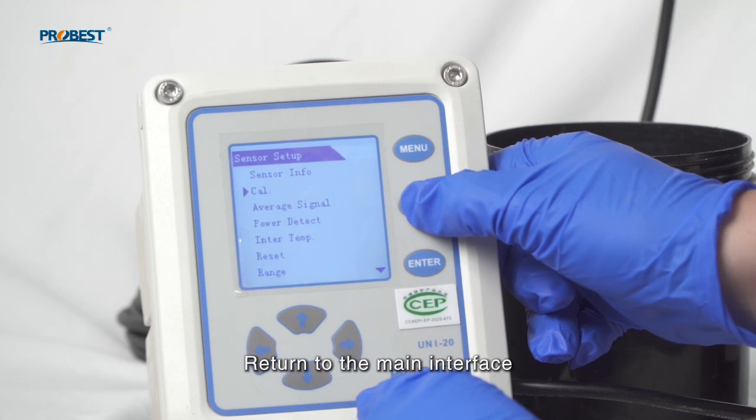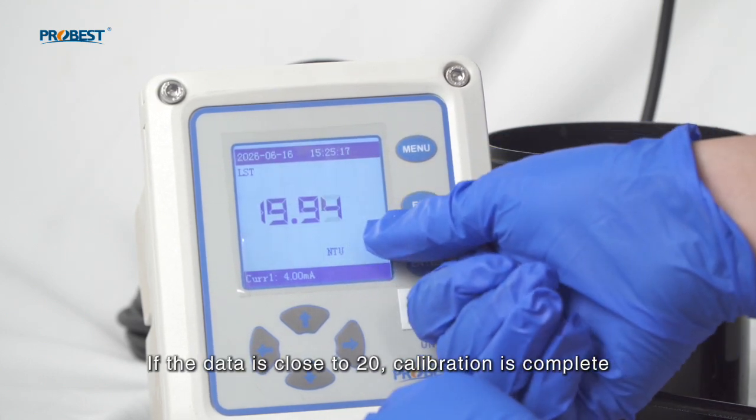Return to the main interface. If the data is close to 20, calibration is complete.